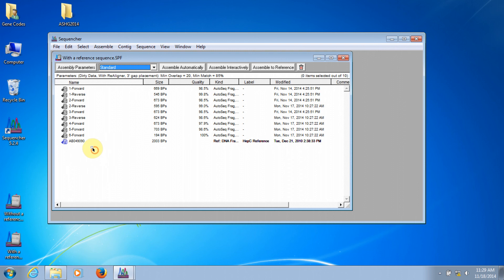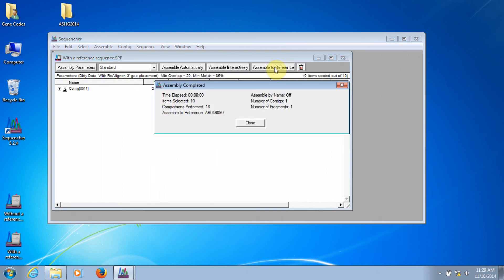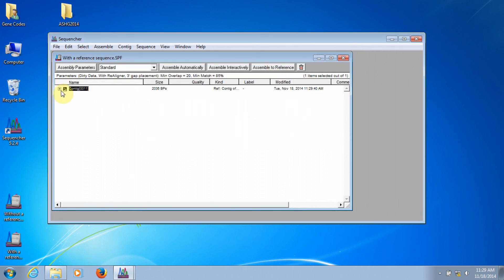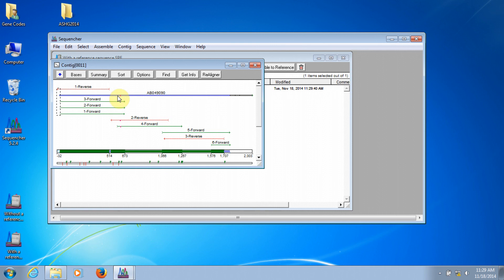Now, I'll highlight all of the sequences and select Assemble to reference. And now, when we look at the overview of the contig, we again see all of the reads that make up the contig, and now we also see the reference sequence here in the contig, and the consensus sequence of the contig at the bottom.